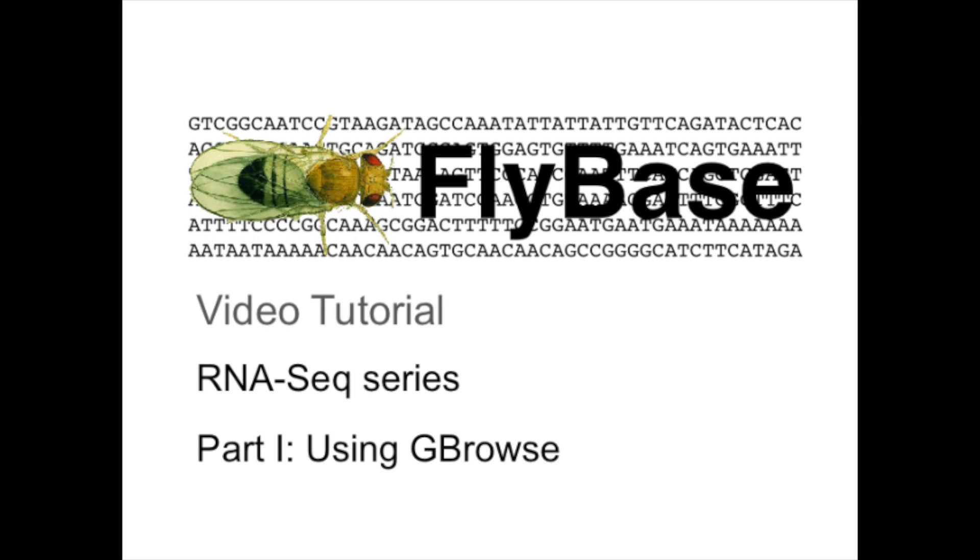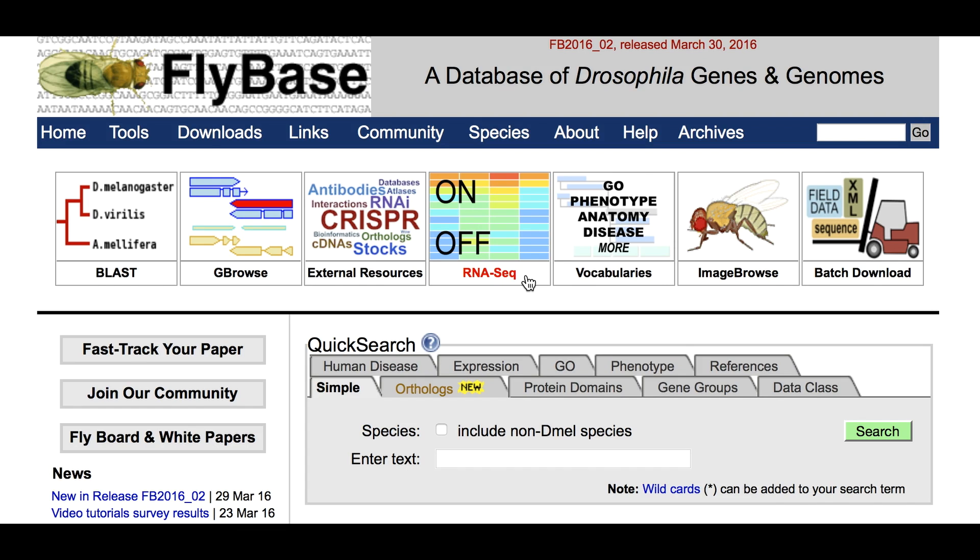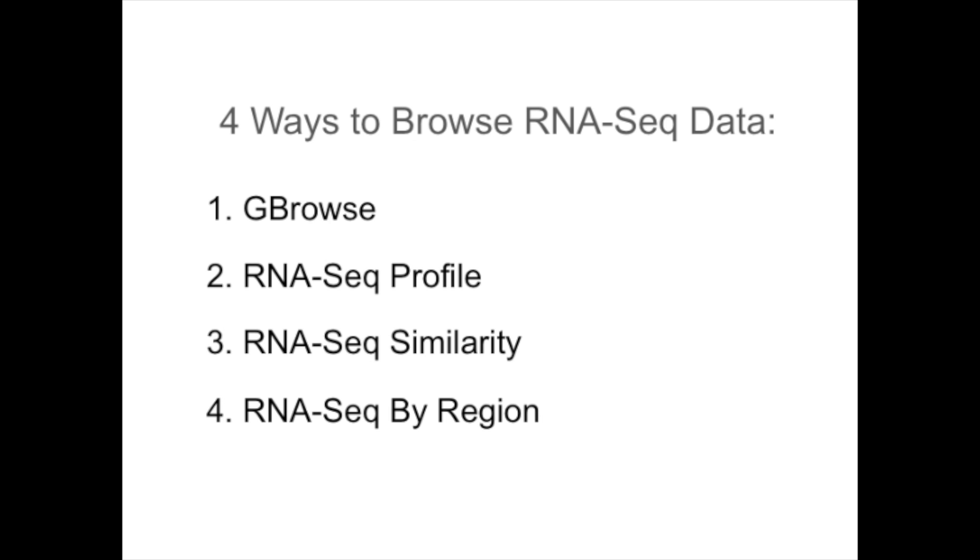FlyBase Video Tutorial ARNESIC Series Part 1 Using GBrowse. There are four ways to browse ARNESIC data in FlyBase and we will review them in this series of instructional videos.